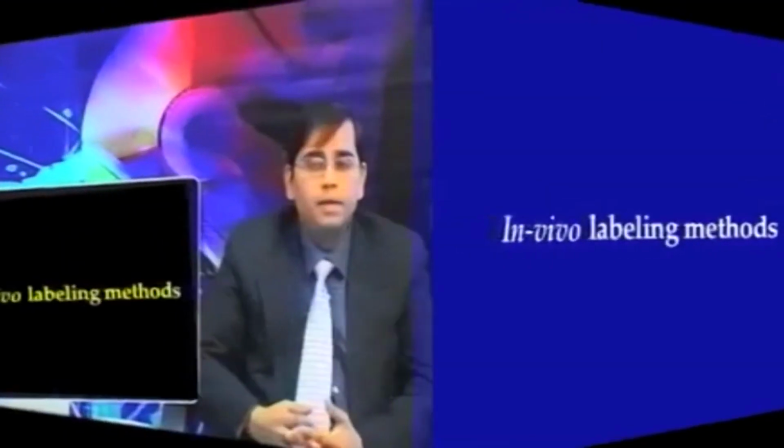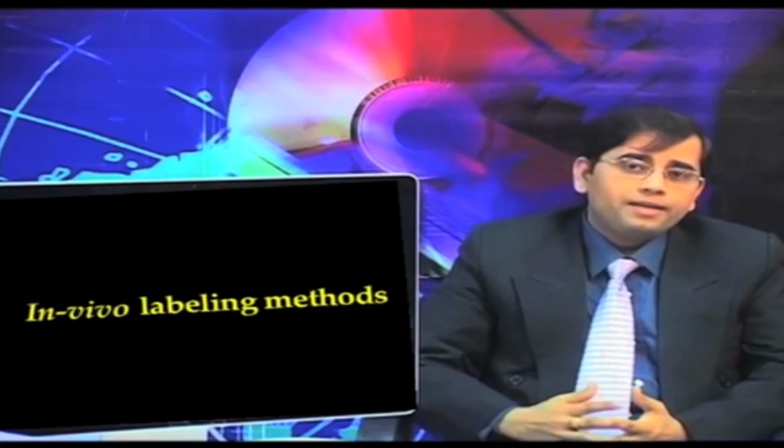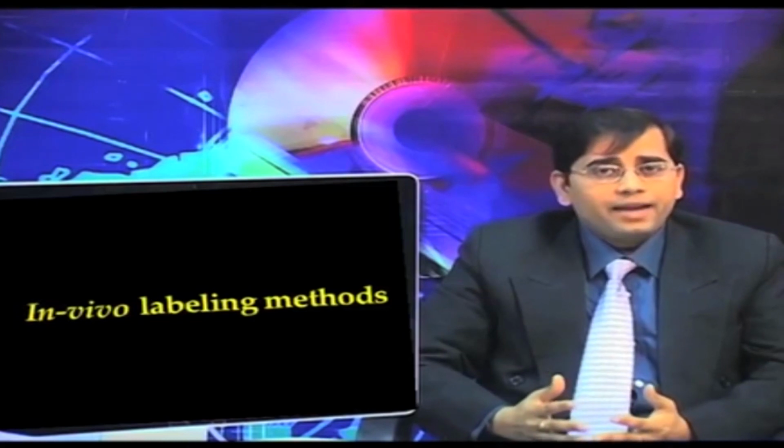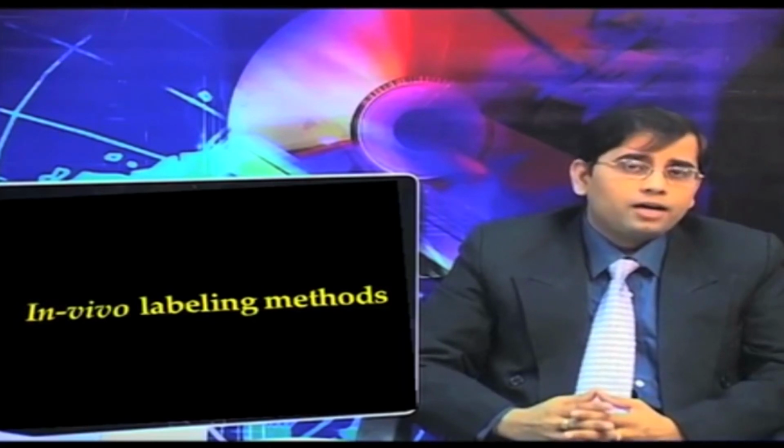Most of the quantitative proteomic approaches by MS utilize isotopic labels as a reference for either relative or absolute quantitation. These labels can be introduced in vivo, for example, by growing an organism in media enriched with specific isotopes. Labels are also introduced by performing tryptic digestion in the presence of heavy water. Many methods using isotopically labeled reagents that react with specific amino acids or the protein N termini have also been developed.